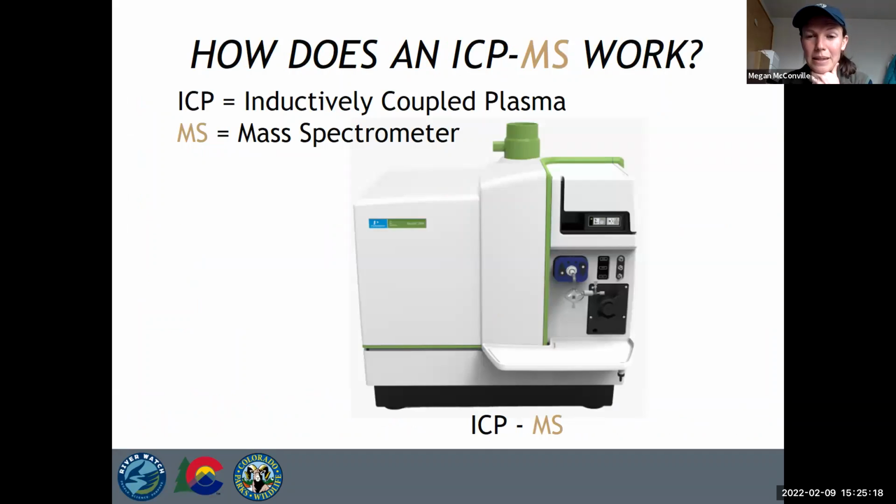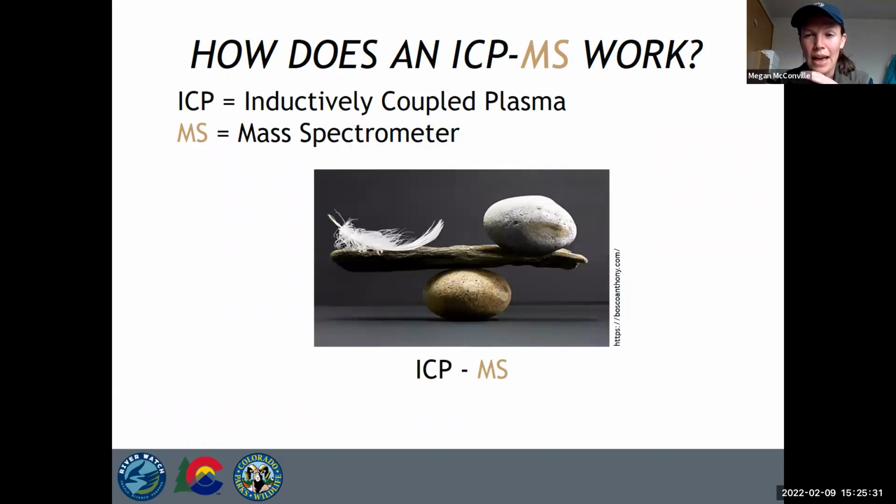Okay, so mass spec. Again, we're going to show you down the road, these fit on a benchtop. They're not huge, but the capacity and what they're doing inside is really robust and exciting. Again, we're looking at mass, so not this optical side of things, not that visible spectrum. We're looking at minute changes in this little feather, right? I snip off a few of those, what are they called?